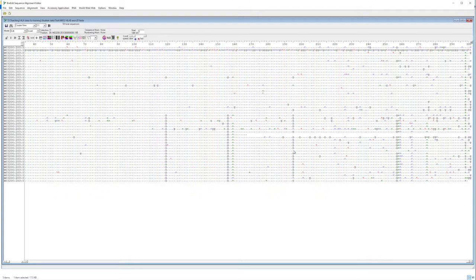But it is important to be aware when you're looking at the sequencing data that you can have reads which, if they come from PCR, are a combination of different starting material, the two different alleles. And it's important to recognize that you obviously wouldn't use these GACs when you're working out the consensus for the first allele because they don't really belong there.